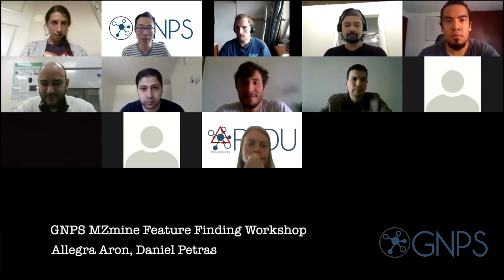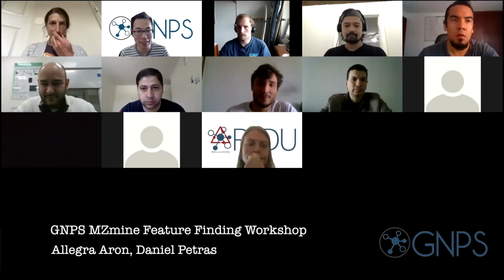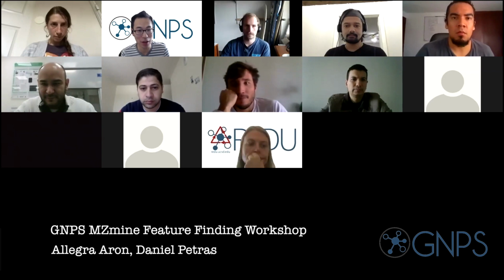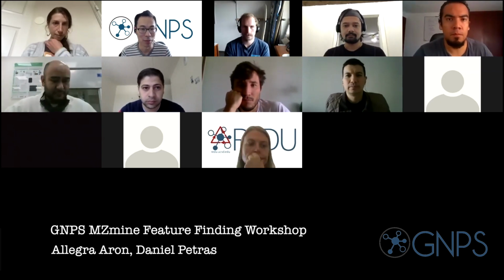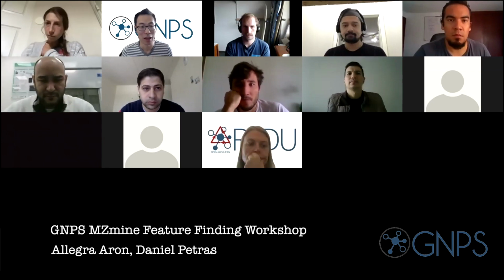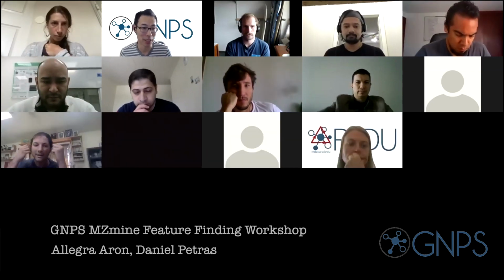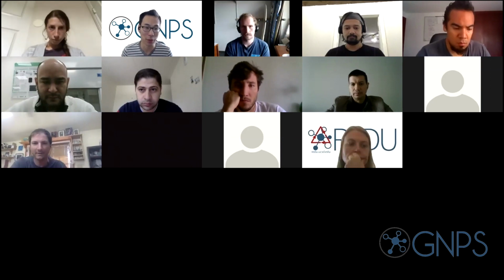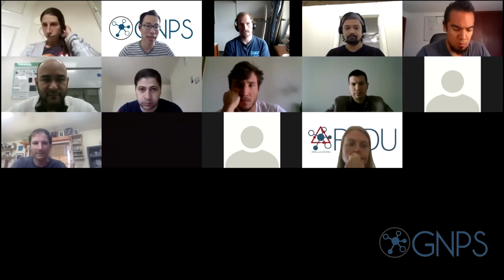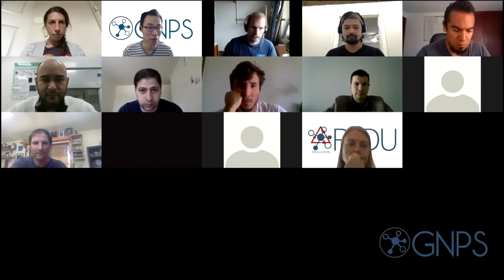So welcome everyone to, I guess, Danny was keeping track, the fifth session for these workshops, hackathons, where we can hopefully share with you something that's useful on analyzing mass spec data. Today's session, along with tomorrow, is learning how to do feature finding with MZmine2, and then taking that to the next step with feature-based molecular networking at GNPS.